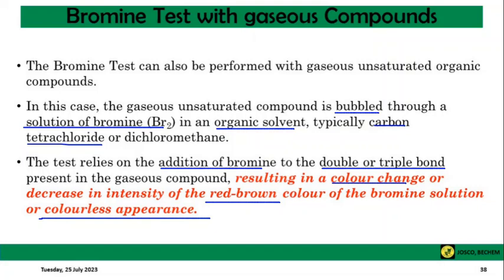So whether you are looking at a water-soluble compound, water-insoluble compound, or gaseous compound while testing with the bromine test, the principle remains the same. Addition of bromine to break the double and triple bond. This would be indicated by the color change or decolorization from brownish red or red brown color to colorless appearance.